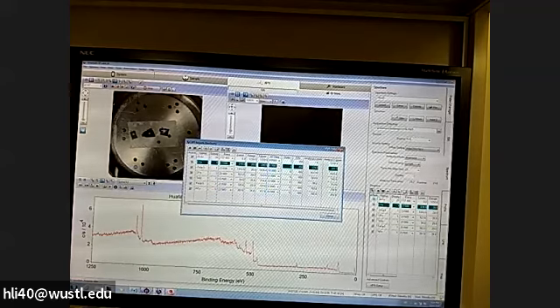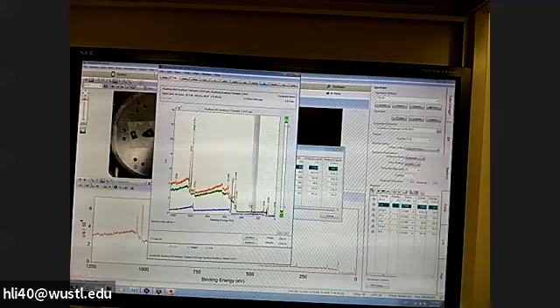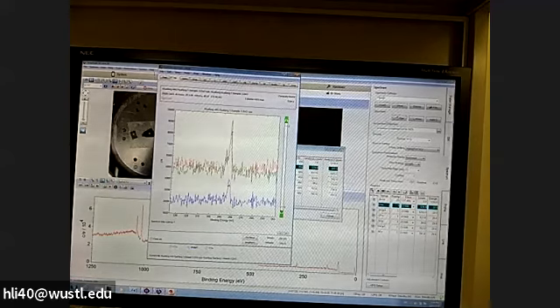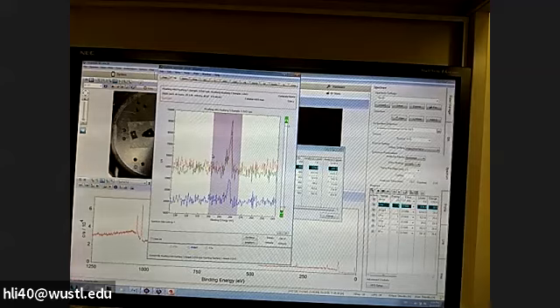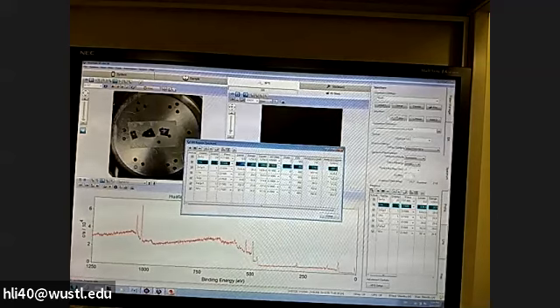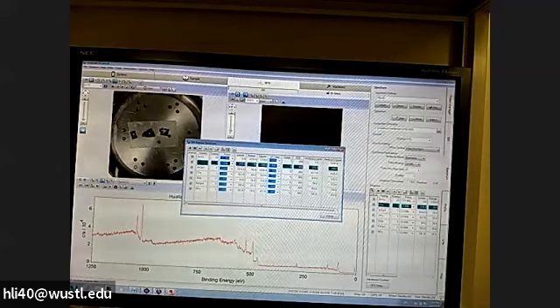Carbon is the element we are most interested in, so we can give it a little bit more scan there. You see the carbon peak here. Just zooming in, the major peak is about 285 because it's carbon nanotube. So we will set up the range around 275 to 300, which will be good for carbon. We start from 275. Let's put a 30 sweep, or maybe even 40 sweep, for carbon. Maybe 30 sweep.